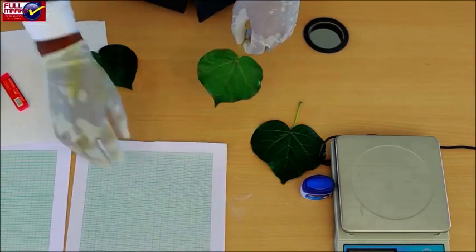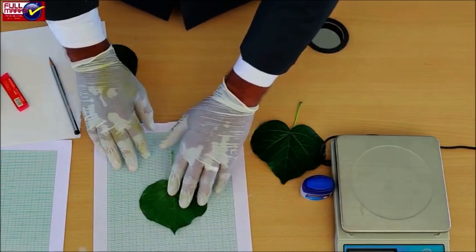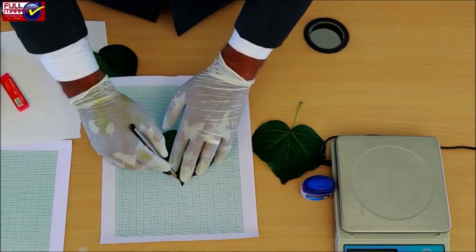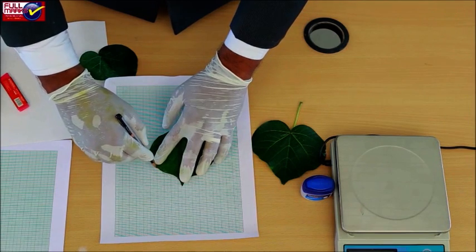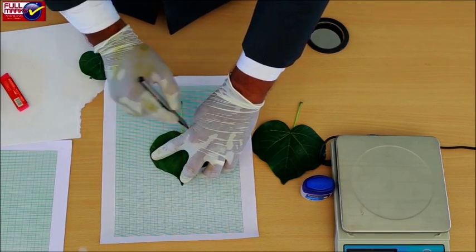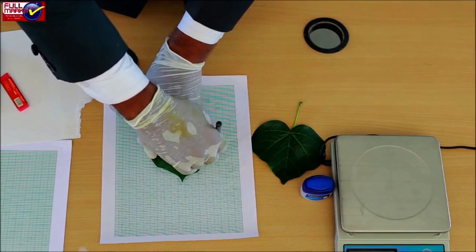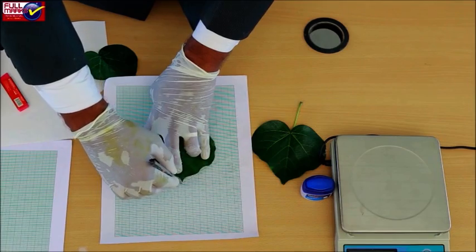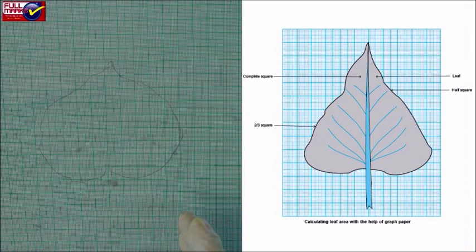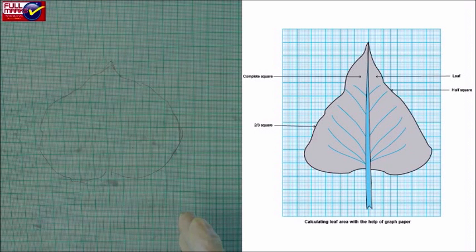Place the leaves on graph paper to calculate the surface area. Trace the outline of the leaf on the graph paper. Within the traced area, calculate the total number of full squares, half, one-third, and two-thirds squares. Add all the squares to get the total leaf area, then multiply by 2 to obtain the total area of both surfaces.